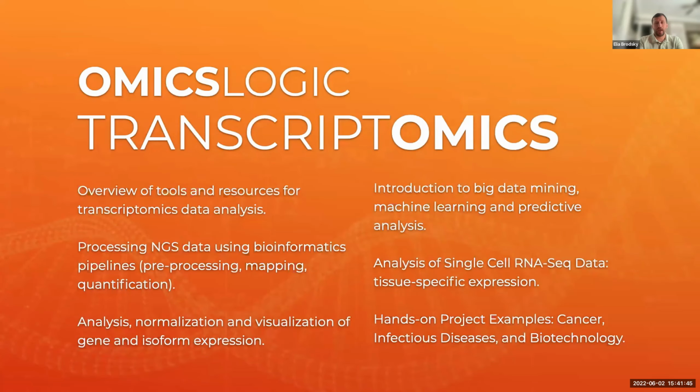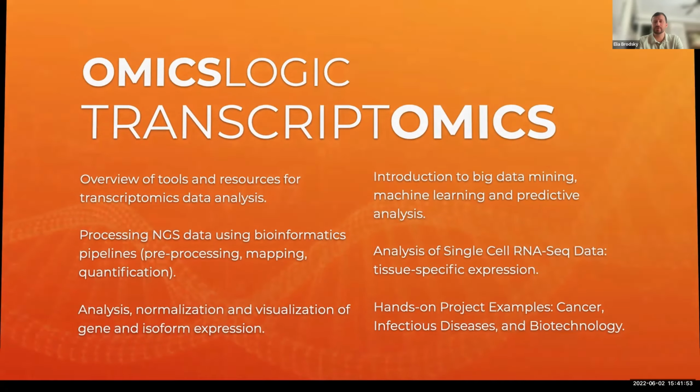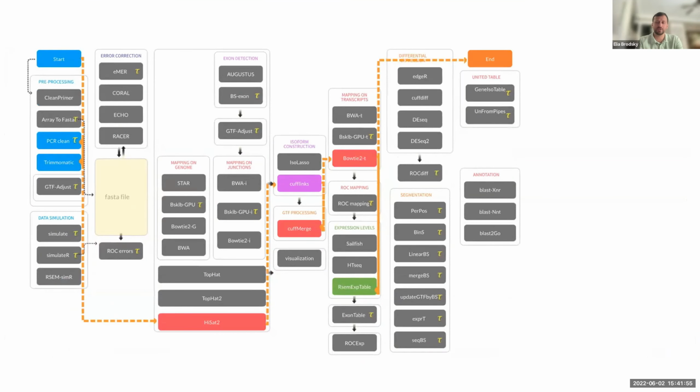The program will have several different sessions. We'll start from just the basic logic of what I explained. How is that processing done? And what are the important steps in that pipeline? And the important steps are going to be how the data is prepared with minimal artifacts, so that our conclusions about it at the very end are actually reliable, something that we can trust.